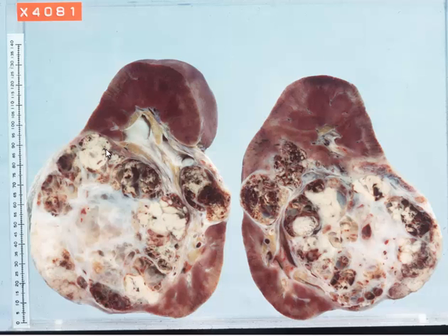This is a very classical appearance of renal cell cancer. As you can see, we've got a kidney here that's been bisected. Upper pole's here, lower pole down here, and we have a large mass that is clearly destroying the middle aspects of this kidney and distorting the calyceal system.